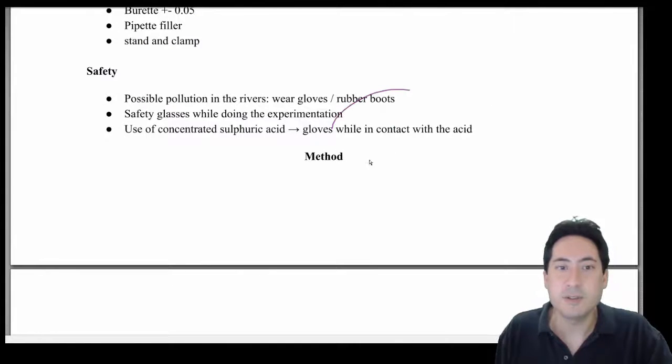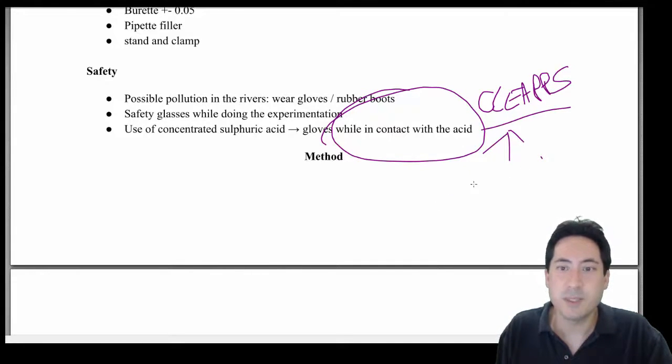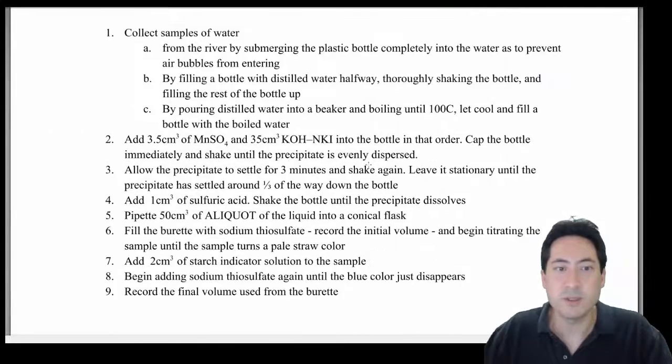Okay, safety, I need this referenced. Where did you get this information? Cleapss, I don't know if I've spelled that wrong, it might be two S's. That's the best place to go. Our school's got a subscription for that, so that's helpful because it's really clear on what to actually do with the safety.